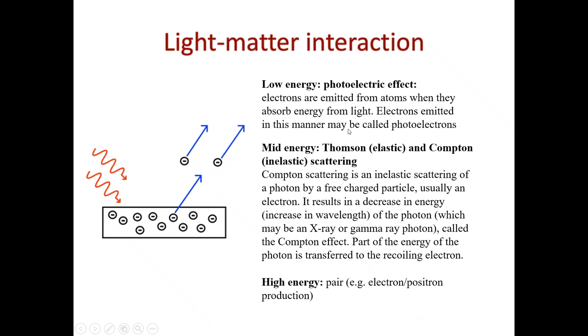Okay. So what happens actually when an X-ray shows up, or any kind of beam really, or photon, that hits a material? So here's an incident beam. This is my little squiggle denoting an electromagnetic wave, and I have a piece of material here. And if this is a low energy beam, we have the so-called photoelectric effect. As I hit the top surface of the material, these atoms will get that energy in, okay? And I might emit some of these electrons. They're called photoelectrons. They're basically the result of the reaction of low energy electromagnetic radiation with the material. Okay, that's the so-called photoelectric effect.